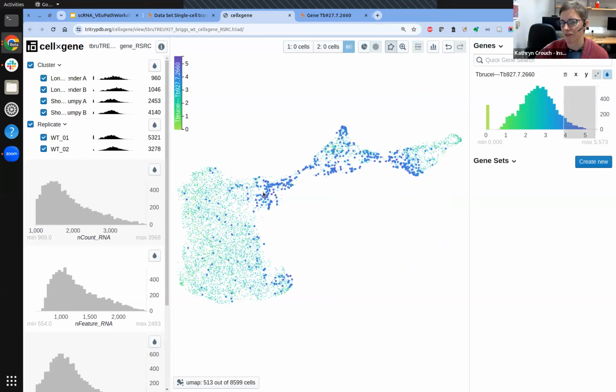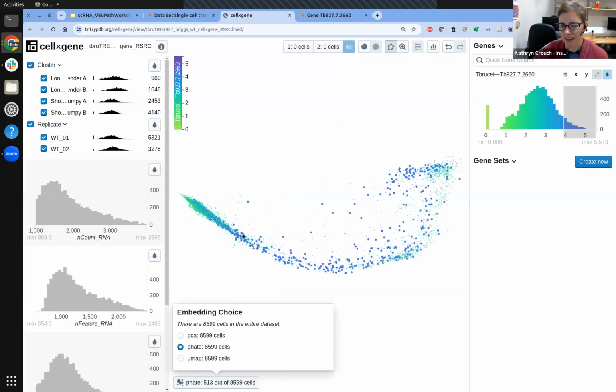We've got a peak of expression sort of here. There's some cells expressing this gene over here as well. And maybe that's fine. We don't really know how early they commit to differentiation. So that doesn't necessarily mean it's not interesting. And if we go back to the fate map, you can also see that here as well. We do have some cells expressing this gene early on, but there's also a lot of the cells in this central part of this trajectory are expressing that gene as well.